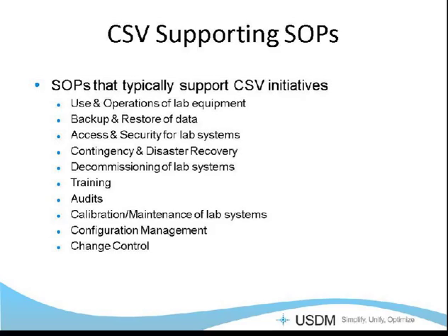Again, we talked a little bit about the fact that we typically use a lot of group logins. How can we control that? Can we continue to use that in a regulated environment? How do we control that? What procedures do we have to put into place to be able to meet the Part 11 requirements and yet allow for flexibility within our laboratory environments to be able to use the systems that we need to use.